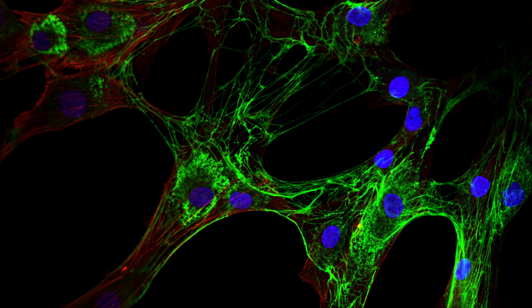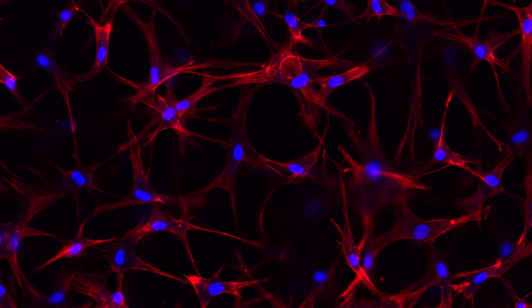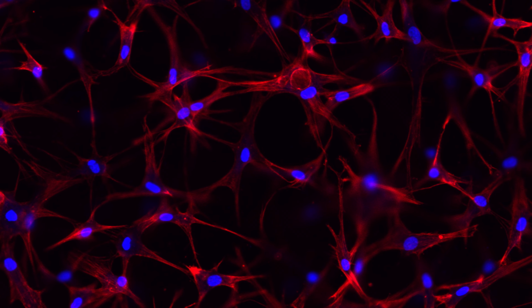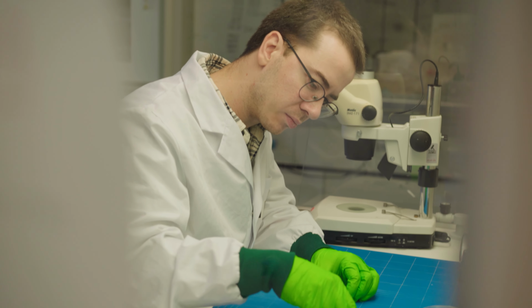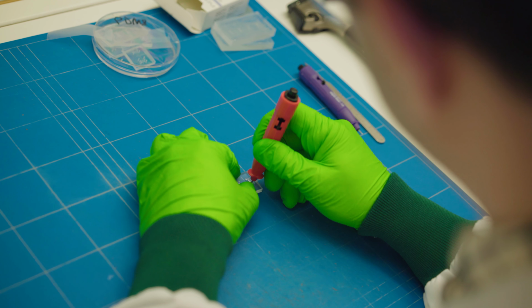Our consortium is broader than the two of us and our two institutes, and also includes rheumatologists and researchers from the Department of Rheumatology at the Radboudumc University Medical Center. All the research we conduct in our group and all the technologies we develop can contribute in the future to a reduction and a replacement of animal experimentation. The main motivation to help me to push this project is reducing and also replacing the animal usage from this area. Because we know that the organ-on-a-chip technology is one of the strongest technologies that we can use to replace all this animal usage.